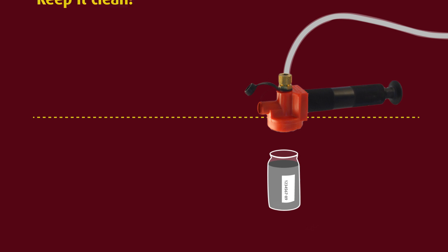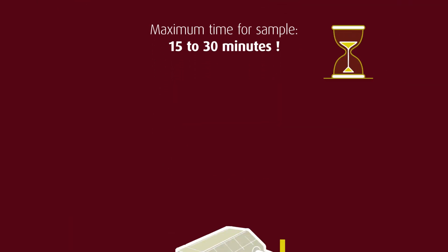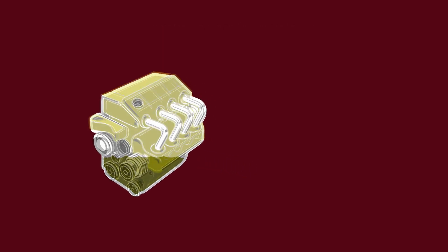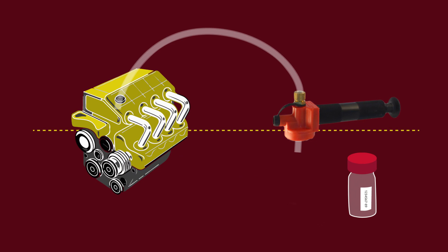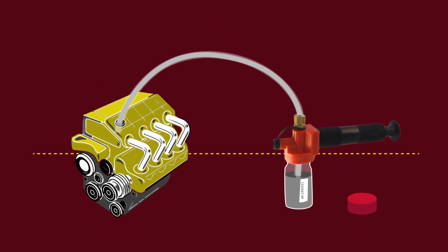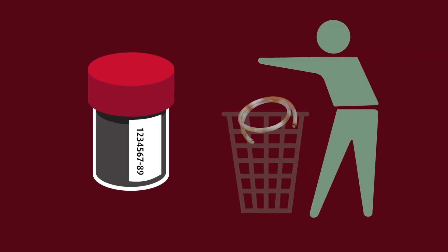Cleanliness is imperative. When you give a blood sample, you, the doctor, and everything around you don't get covered in blood. Likewise, there is no reason to get everything covered in oil when taking a sample. Once again, the 15 to 30 minute post-shutdown window of opportunity to get oil samples applies. Insert the sump end of the tube halfway down into the oil. Keep the bottle capped right up until the point of threading it onto the pump. Fill the bottle no more than to the top of the label. Cap the bottle immediately after removing it from the pump. After taking the sample, discard the tube.